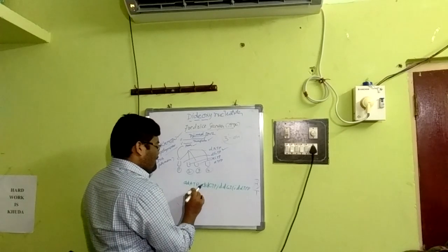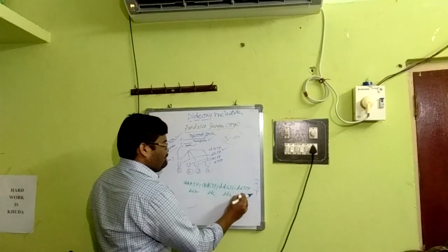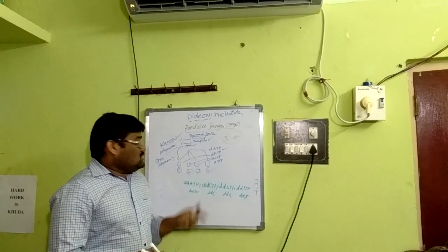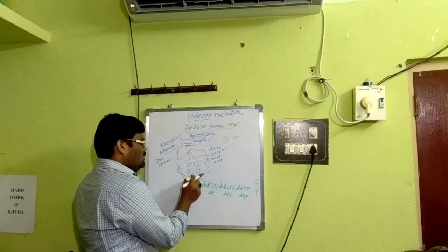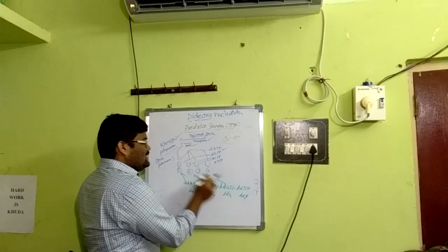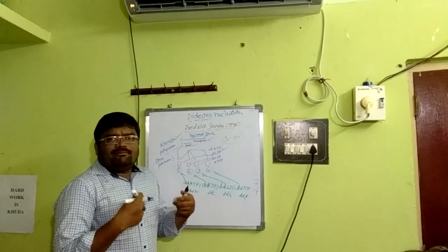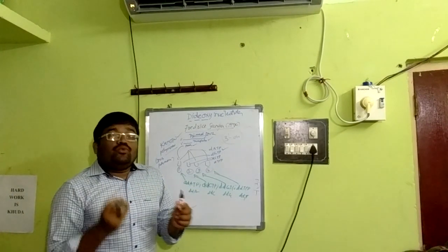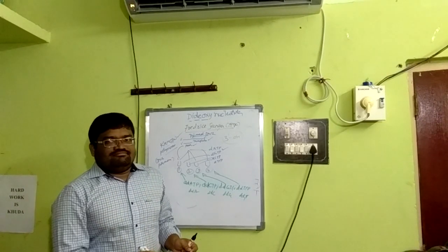Simply ddA, ddC, ddG, and ddT. Then we add one to each tube: ddATP here, ddCTP here, ddGTP here, ddTTP here. That means along with the basic requirements which facilitate DNA replication, we also add the dideoxynucleotides, one in each of tubes 1, 2, 3, 4 respectively.